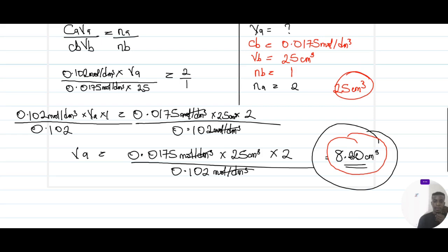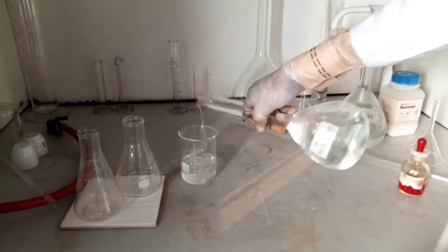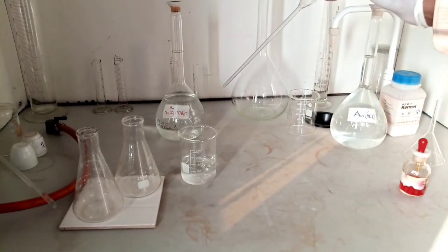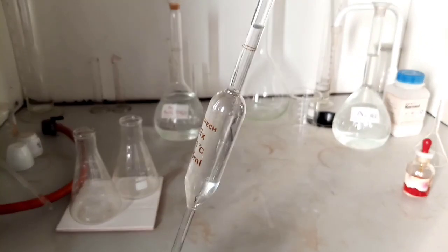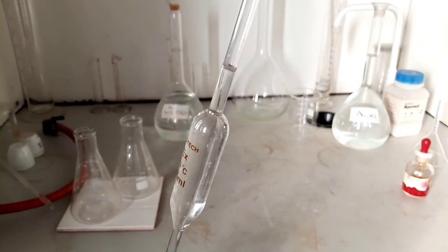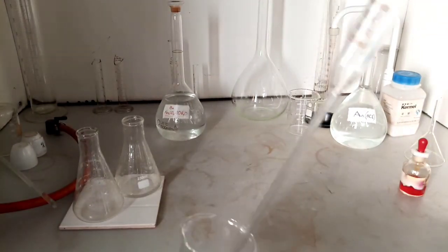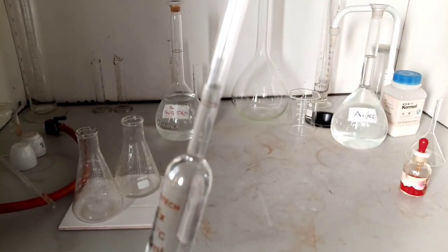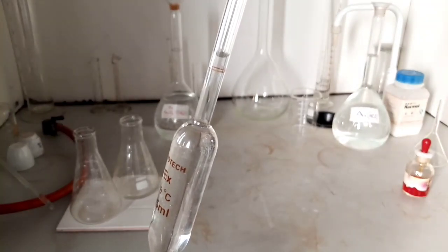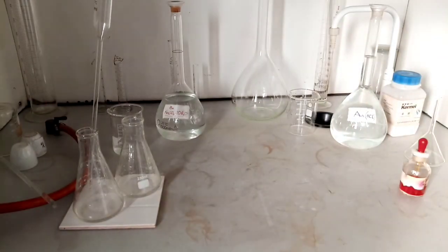So this is your Va. All right, jot that down. So we should proceed further to the titration. Here is our Bn, the base. You turn a little to your beaker. You prepare 25 cm cube from it. You adjust to the meniscus. That's 25 cm cube, the first conical flask. Then you want to measure into the other conical flask. So you adjust to the meniscus also, into the other conical flask.